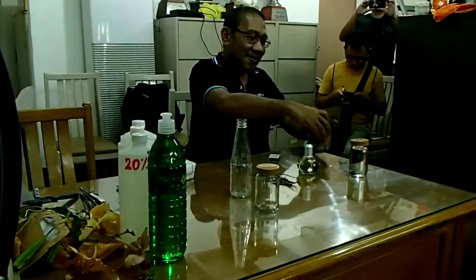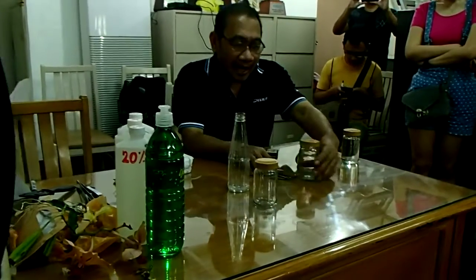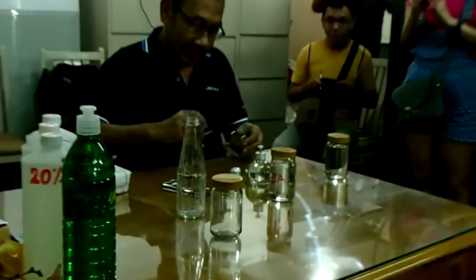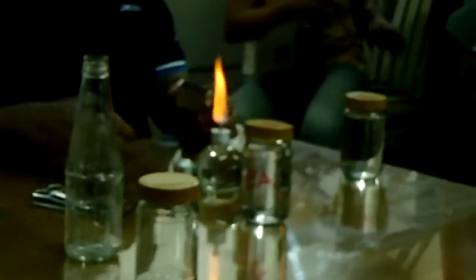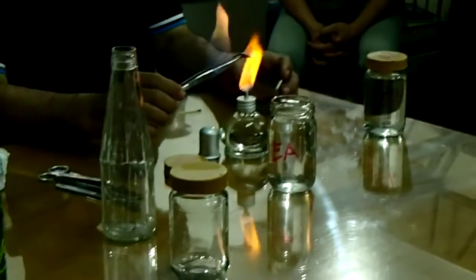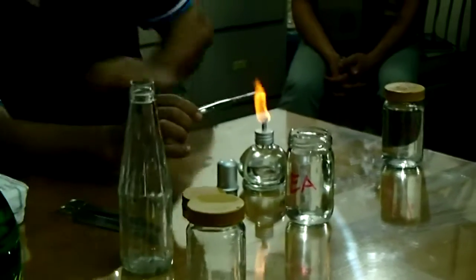This is ethanol, this is the alcohol lamp. Light it up — always keep it beside you. If you need to use it, it's always ready. Just warm it up a little. Okay?